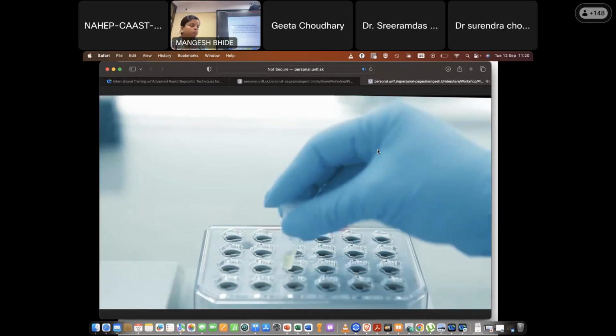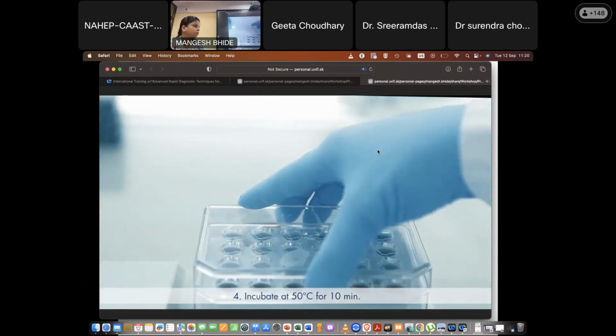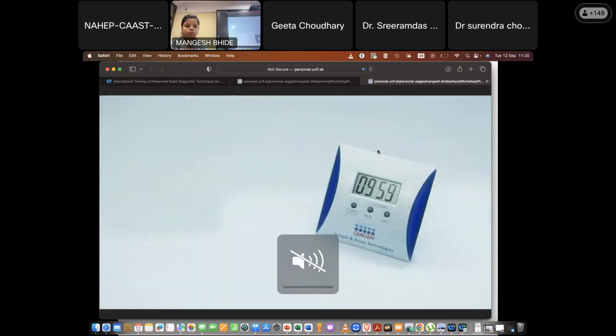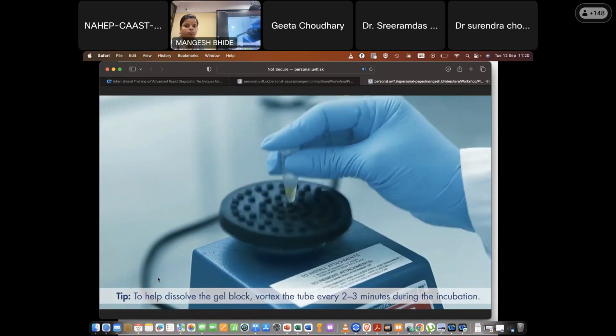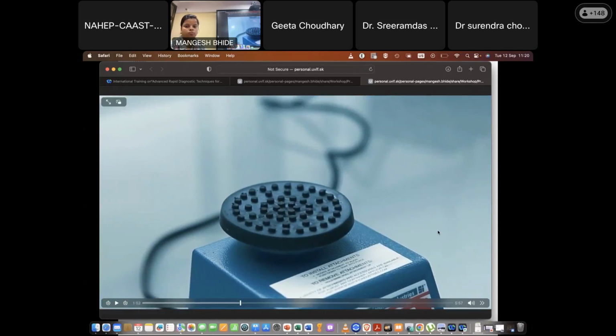Here you see 400 milligrams total weight, but what I try is to remove all the parts which are not fluorescent. I cut it short and keep only that dense part, and that is giving me very good results.